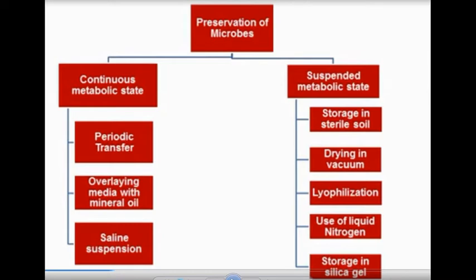After growing the organism for about 25 hours at the respective incubation period, the organisms will be further preserved in a refrigerated condition for over 1 month, and periodically the organism has to be transferred into a fresh medium every month.